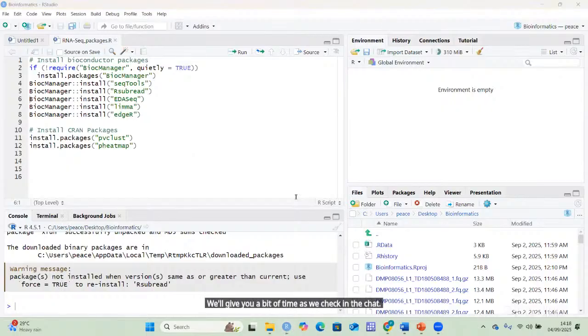Can I install at once by highlighting? All right, so in this particular case, we tried it. What happens is you might fail to update all the packages. So you might end up making an update for only one of them, and then they will not be installed. So please install them one by one so that we know that you have successfully installed the packages.